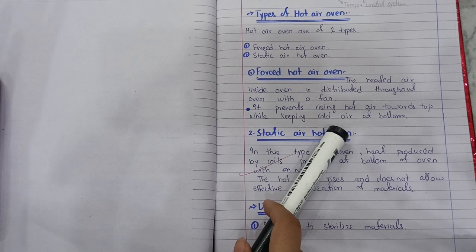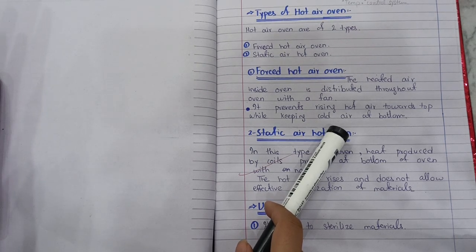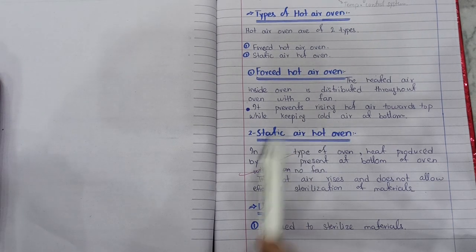देखें, अगर कोल्ड एयर नीचे की तरफ बैठ जाएगी तो जितने भी इंस्ट्रूमेंट आपने नीचे वाली ट्रे पे रखे होंगे वो तो स्टेरलाइज होंगे ही नहीं. तो इस वजह से इस फ़ैन का होना ज़रूरी है.